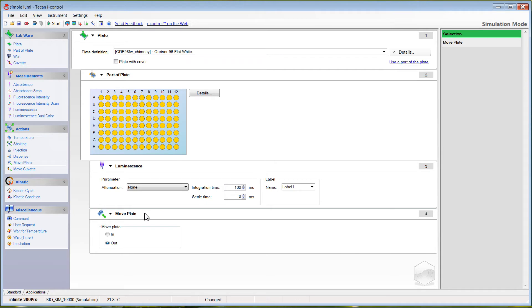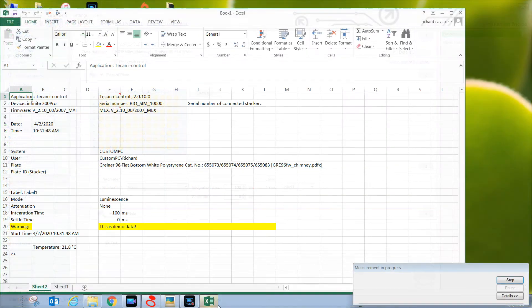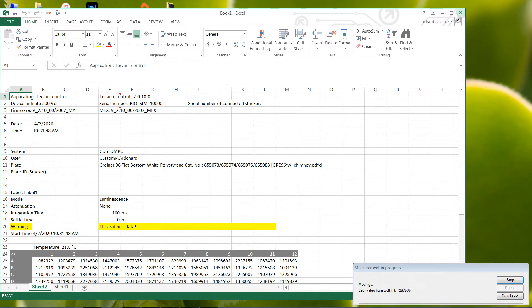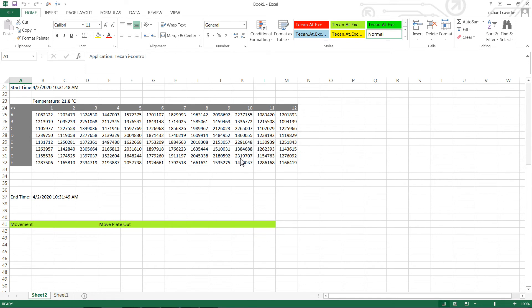We can go ahead and do a test read here. This simulation will drive data out into Excel. I now have a matrix of output — of course this is simulated, but in your assay you'd expect to see signals anywhere from zero counts all the way up to very high counts. This example has counts out to at least a million, which is perfectly acceptable for this instrument. You want to see single to double digit counts for your background and some increase in signal for wells where you have sample.